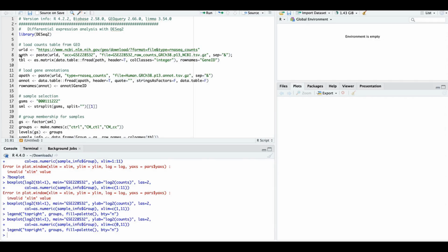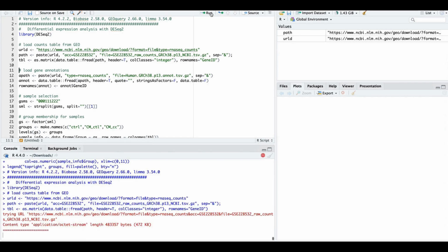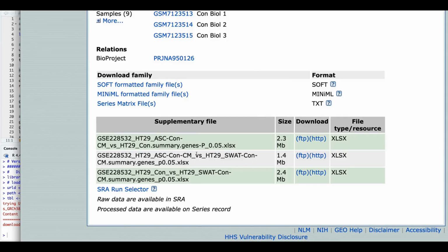I made this script online in DESeq2, then copy-pasted it into RStudio, and in its native format you load the DESeq2 library, then you import the data. Pay attention that you cannot get this read counts file from the usual place of supplementary files.